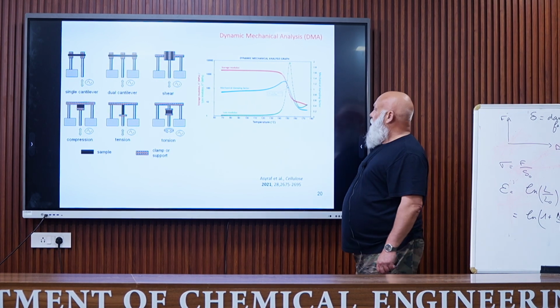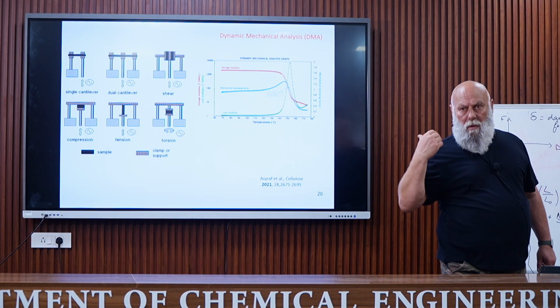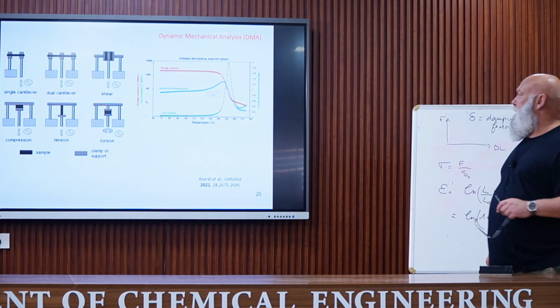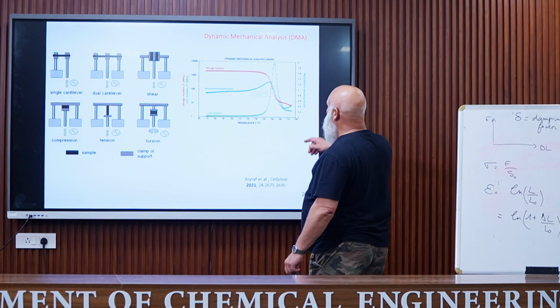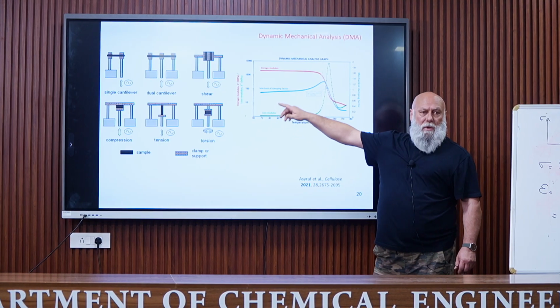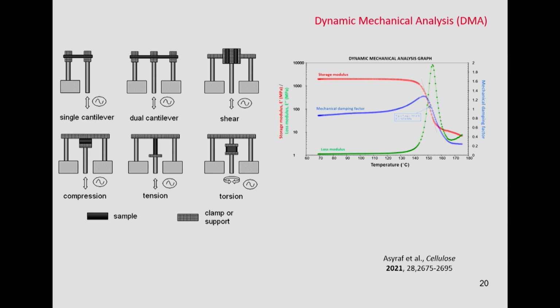of the storage modulus. The magnitude of the drop of the modulus during this relaxation, which is associated to the glass transition temperature of the polymer, depends on the nature of the polymer. If the polymer is fully amorphous, we have a drop over at least 3 decades. If it is lower, which is the case here, it is a semi-crystalline polymer.